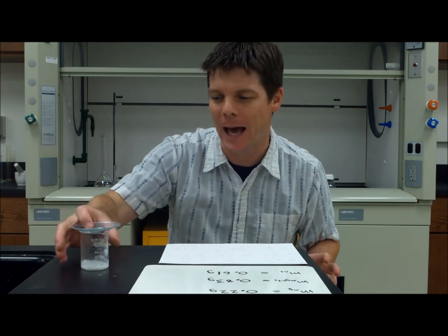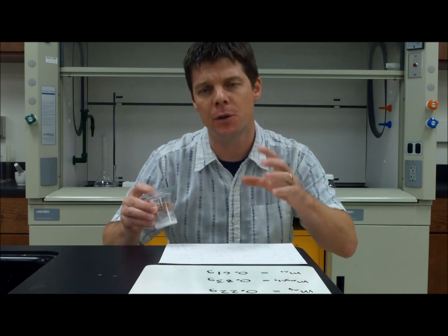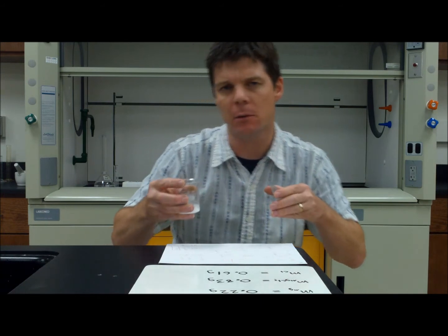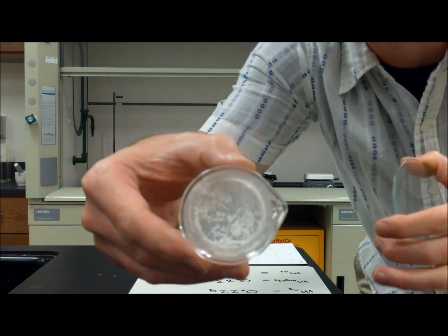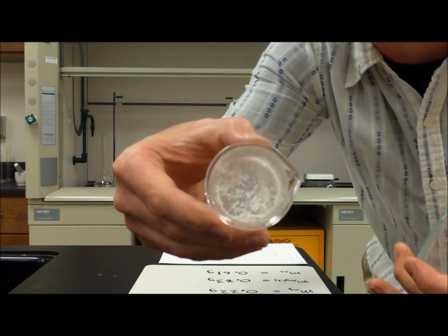All right, so now we've completed the magnesium chloride lab and remember we were reacting magnesium with hydrochloric acid to produce a salt, magnesium chloride. And I'll let you go ahead and see what that looks like here. So we see that the magnesium chloride is a white crystalline material.